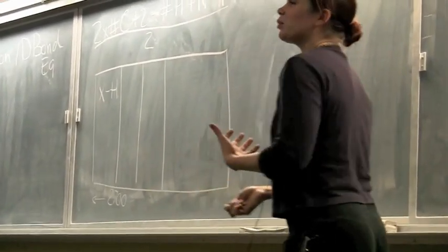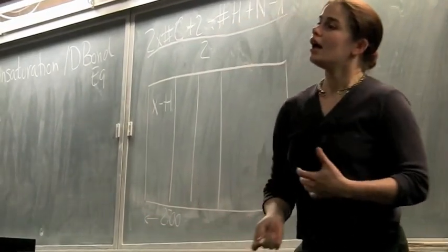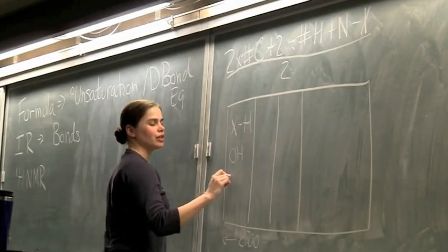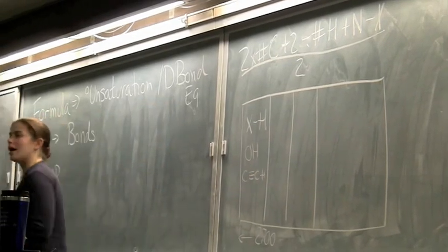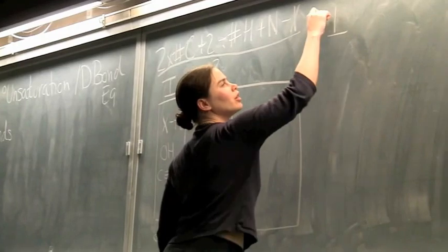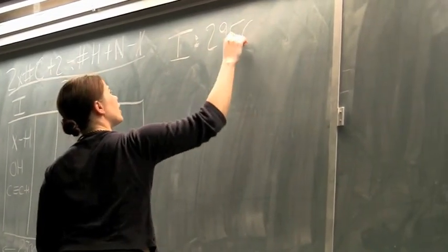It doesn't matter what that something is, it's something attached to hydrogen. If it's way up there on that left-hand side, you're looking at something attached to hydrogen. And within that, we see a couple of neat shapes, a couple of neat functional groups. You can see your OHs, you can see terminal alkyne Hs, you can see all sorts of fun patterns. For that range, we'll call it zone 1, so I can make some notes. Stuff for zone 1 is right around 2950 is regular old alkanes.